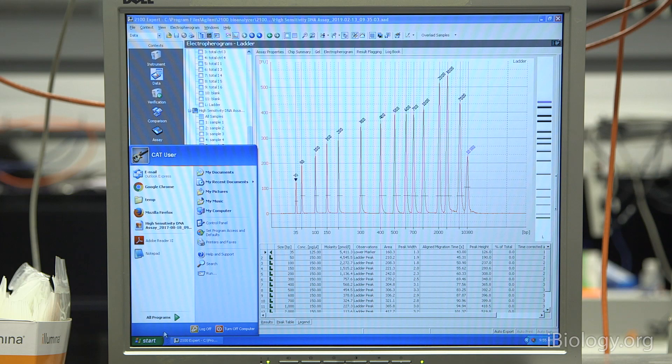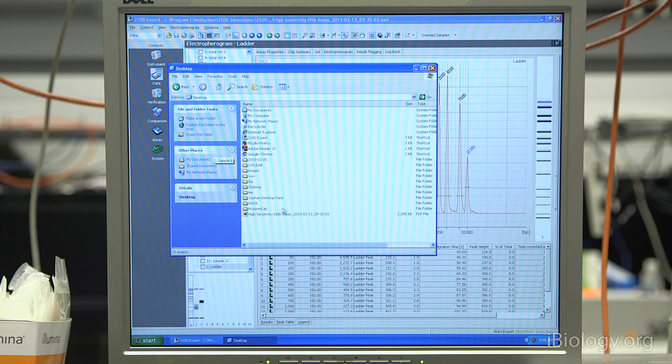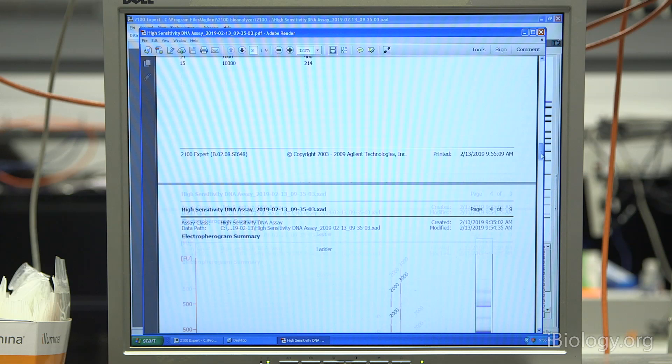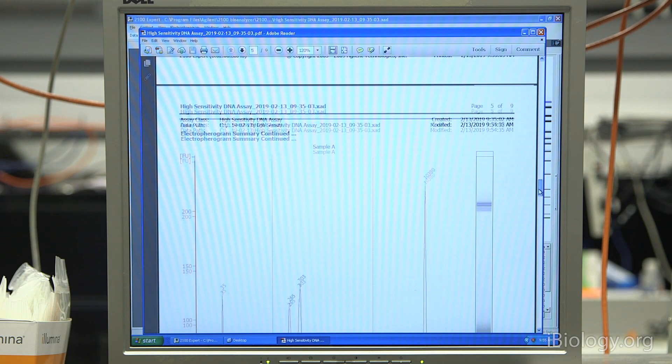If we go to the desktop, we should be able to see our PDF file. And that should be here. If you double click on this, you'll see a summary report on the first page. As you scroll down, you'll see the ladder over here. You want to see nice, tight, sharp bands or peaks on the ladder. Then you'll see the samples.